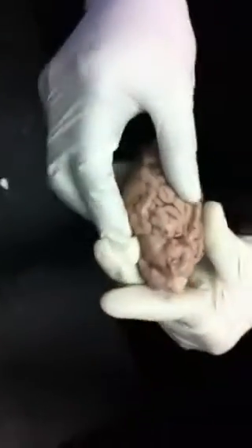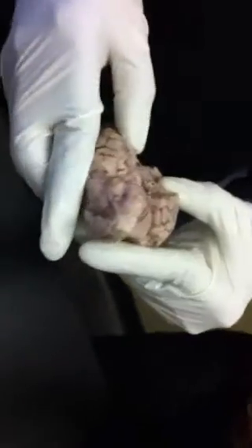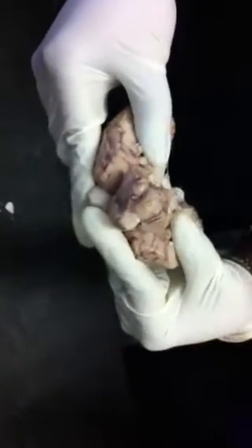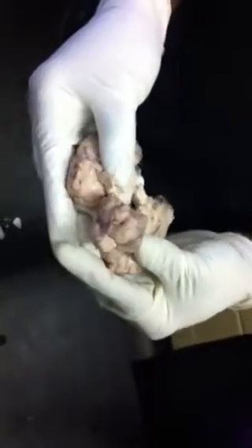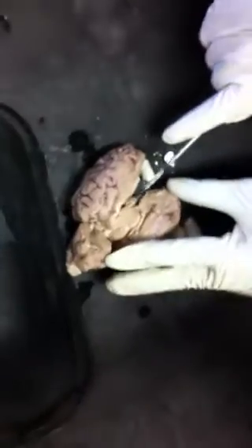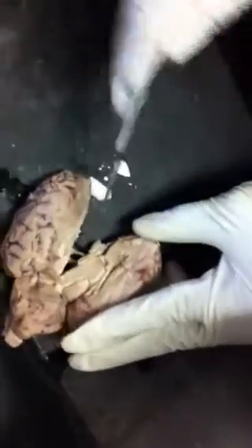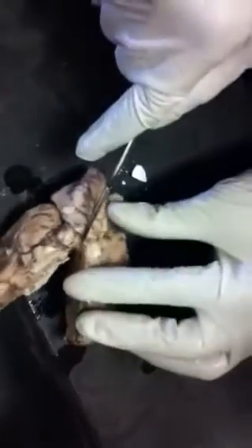So let's divide it into two. Beautiful. I'm gonna cut this. So I'm dividing the optic chiasm here. I'm gonna cut the brainstem way down.